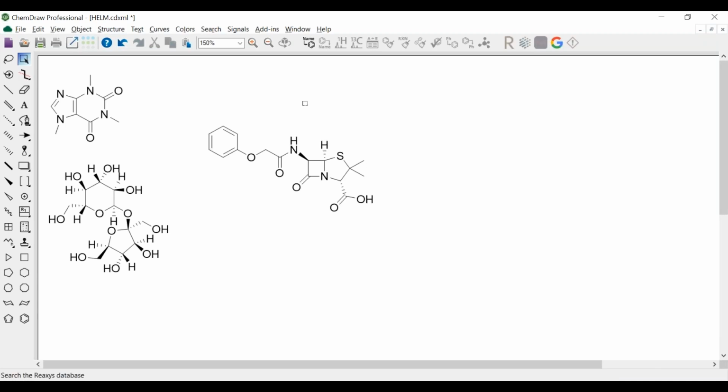However, if you have Signals ChemDraw, you actually can build a connector to any database that you might have. So maybe you have a registration system where you put all of your unique and proprietary compounds, and you want to be able to call those onto the canvas, just like I did those commercial compounds from ChemACX.